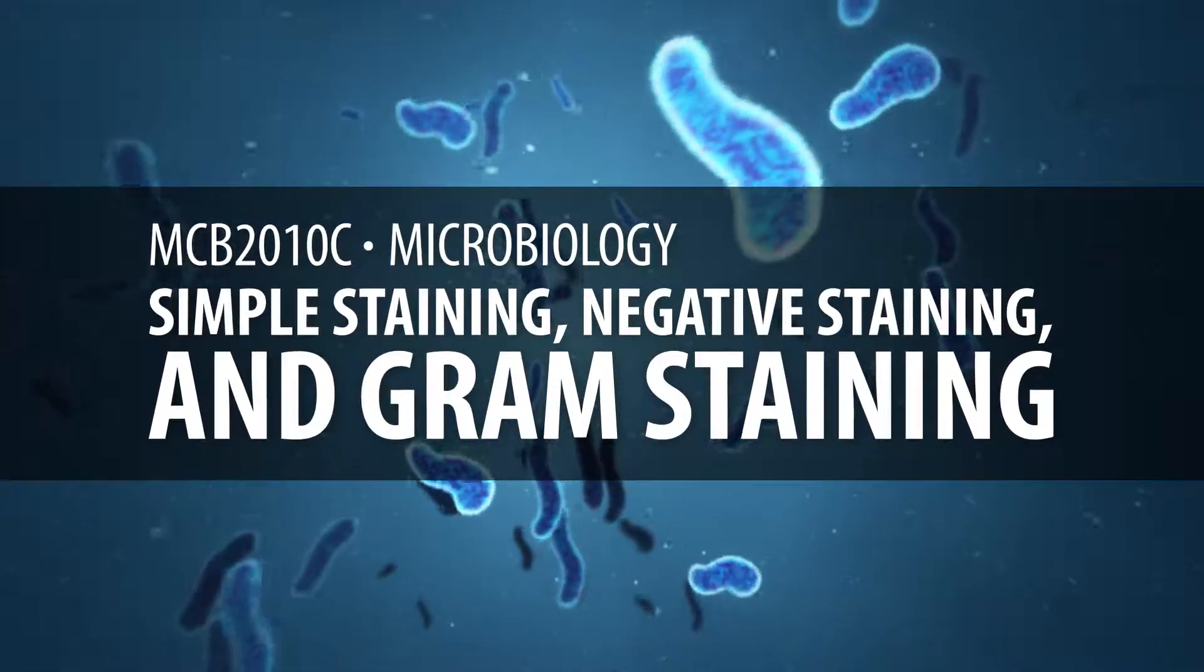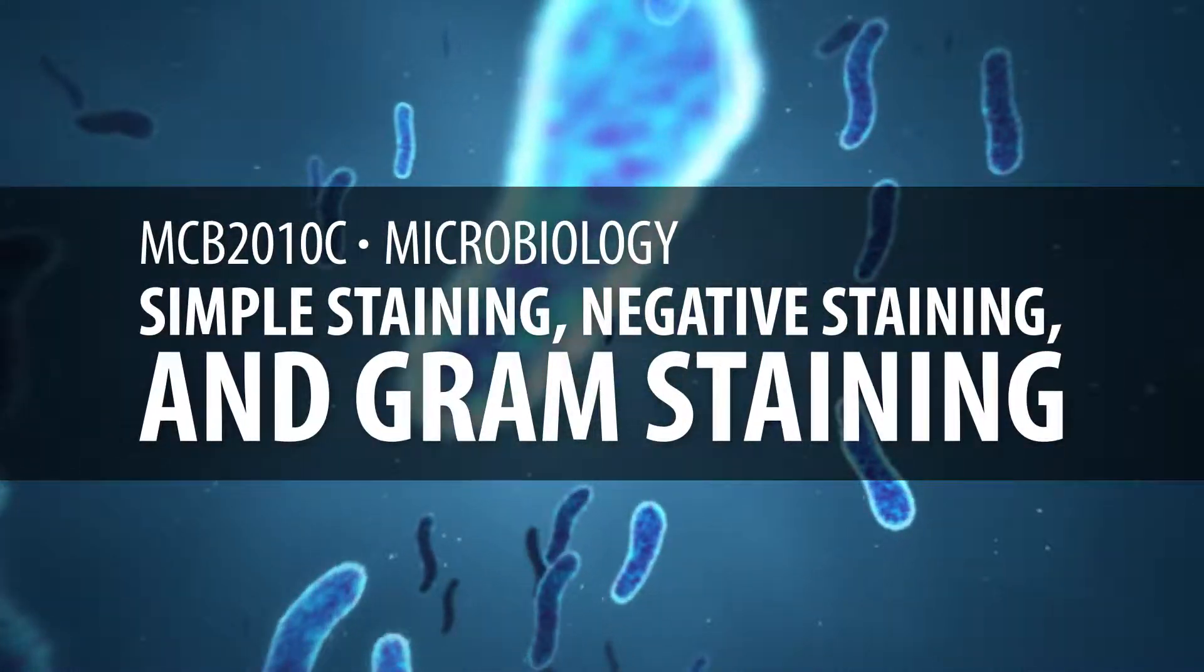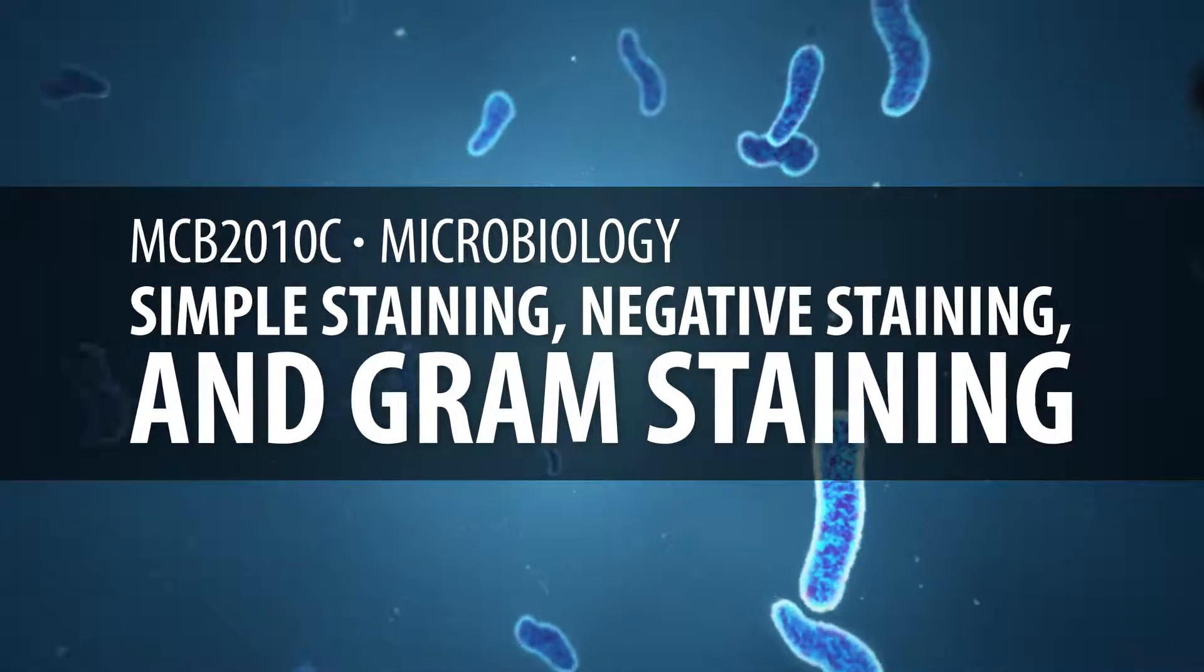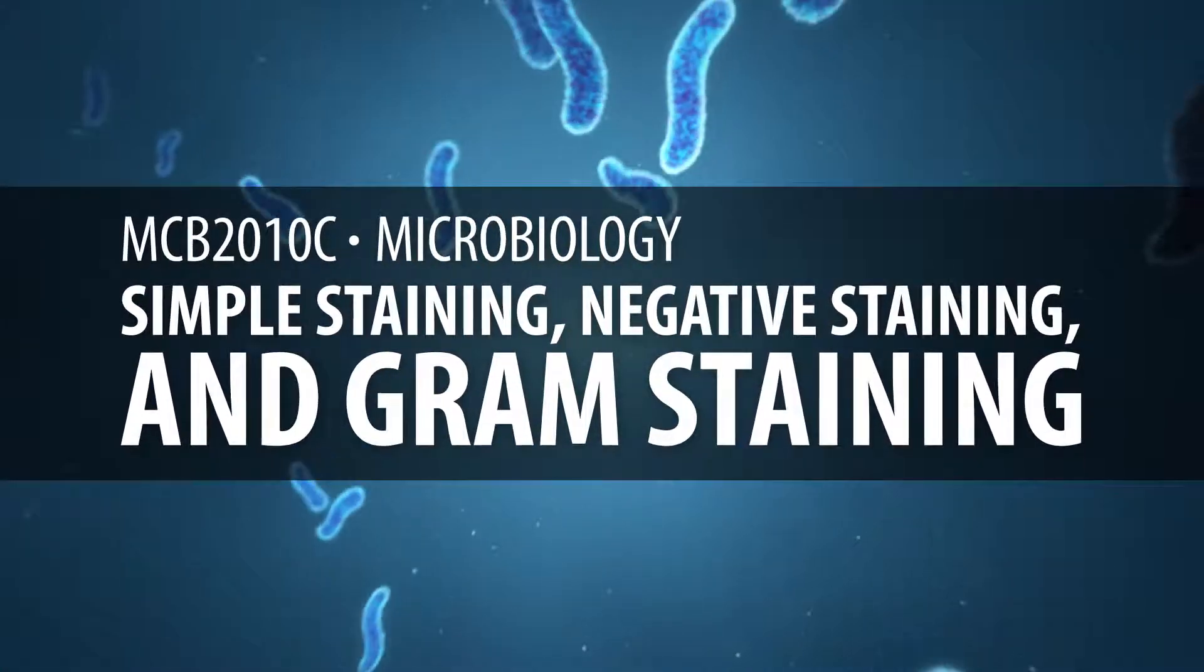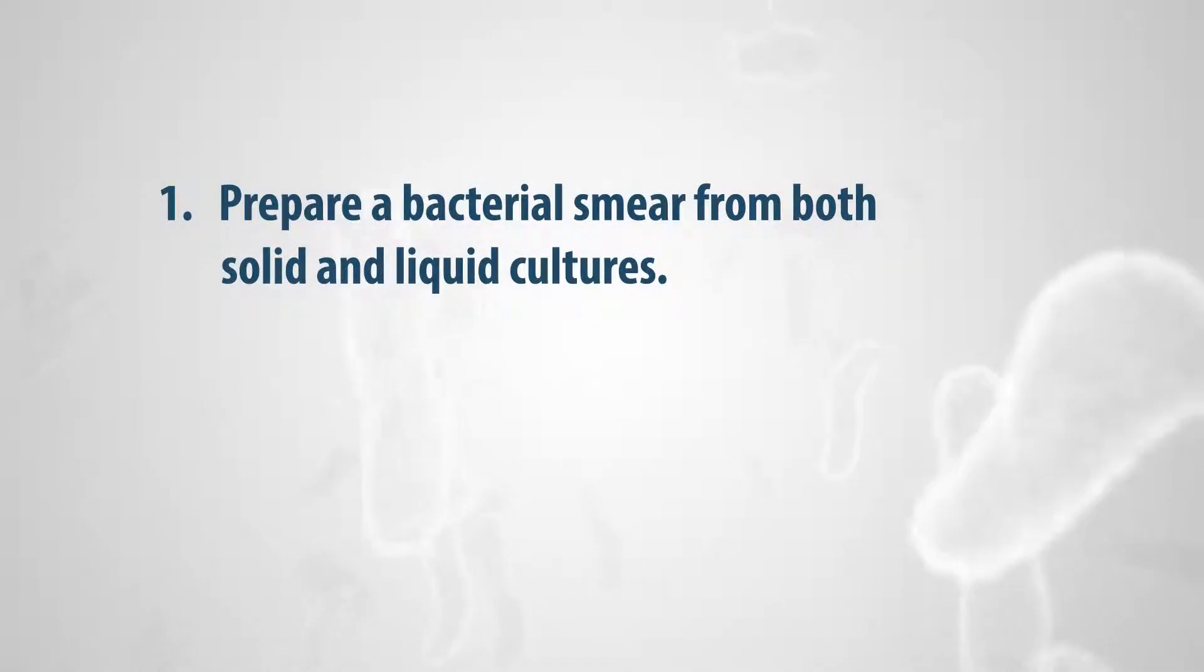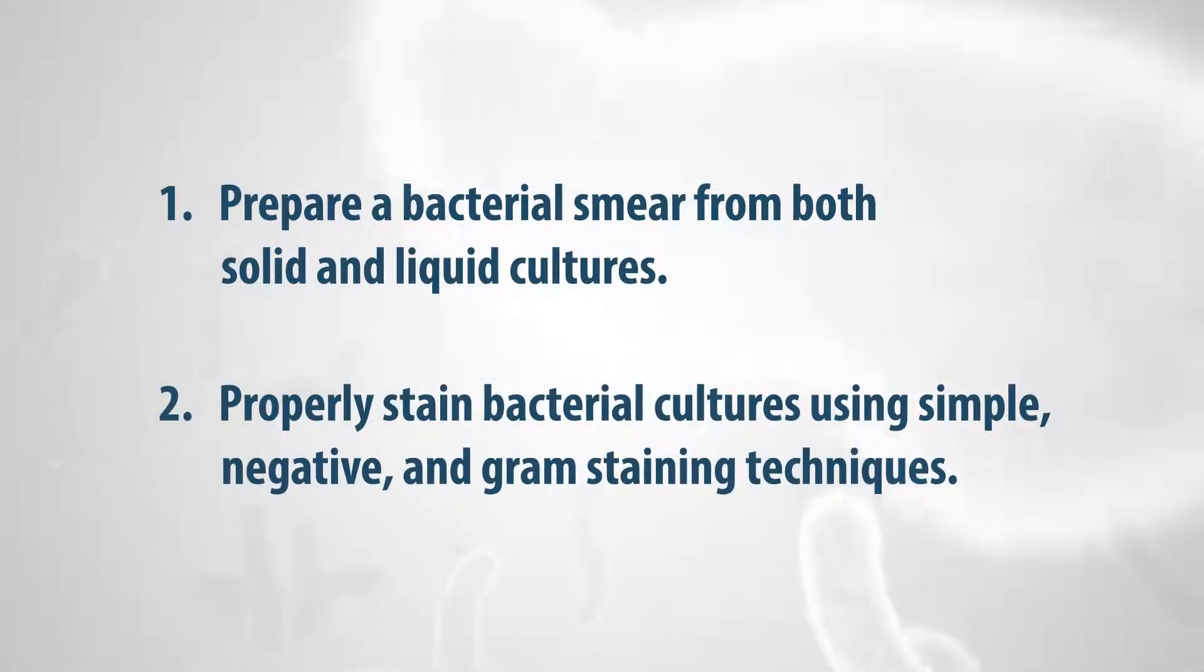Simple Staining, Negative Staining, and Gram Staining. After completing this video, you should be able to: 1. Prepare a bacterial smear from both solid and liquid cultures and 2. Properly stain bacterial cultures using simple, negative, and gram staining techniques.